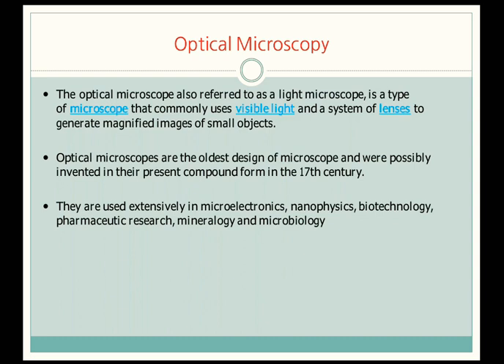This is a field of examining microparticles which are not visible to the naked eye. The components which are not visible to us through the naked eye, we will examine with the help of a microscope. So a microscope helps us to see small particles by the use of visible light and a system of lenses.